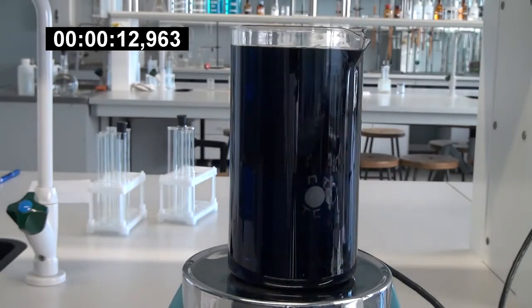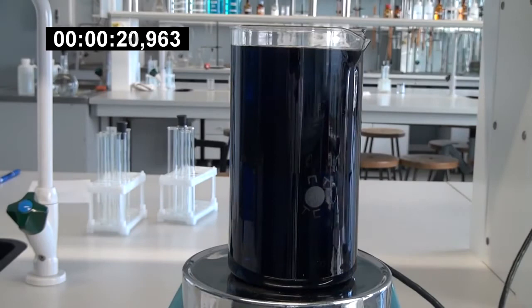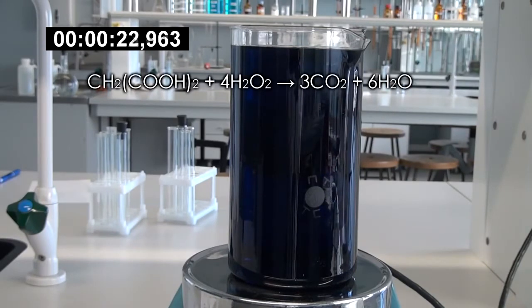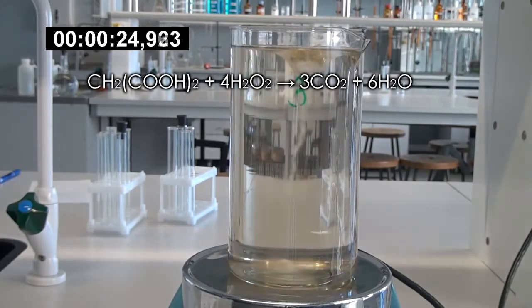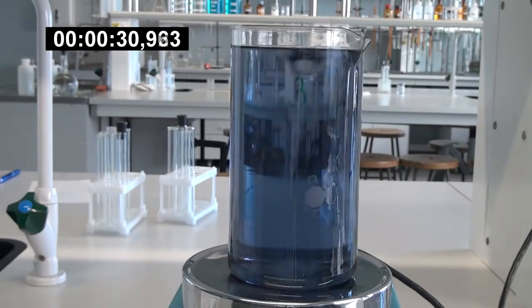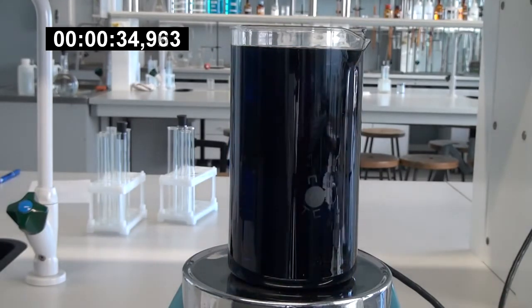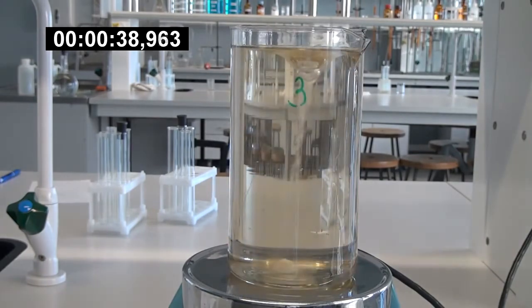That is why the reaction is called a chemical pendulum. After each cycle, the reaction slows down and the next cycle takes a little longer. The essence of this reaction is the oxidation of malonic acid with hydrogen peroxide, which produces carbon dioxide and water. The reaction has a complex scheme. Yellow color appears due to the formation of free iodine, and the blue color is due to the reaction of starch with free iodine.